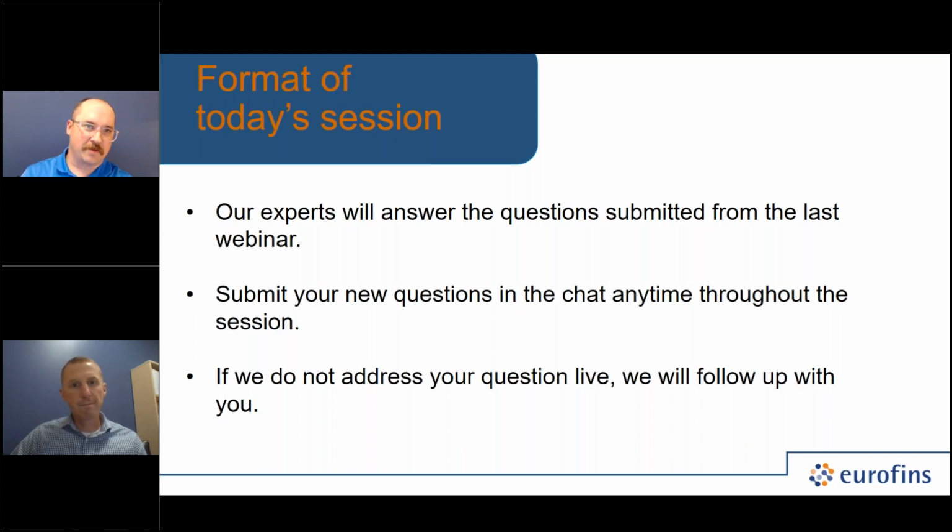Sure, thanks, Dave, and thanks everyone for joining this morning. As Dave and Amy said, my name is Anjay Benkowski. I'm the technical manager for probiotics and dietary supplements with Eurofins based out of Madison, Wisconsin. Today, we're going to be answering some of the questions that we received during our last webinar that was presented a few weeks ago in regards to testing probiotics by flow cytometry.